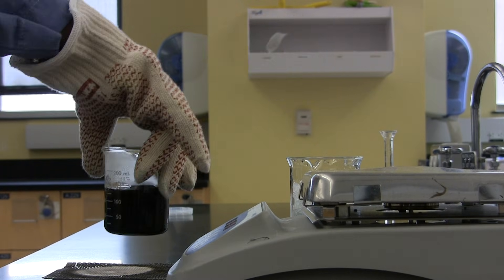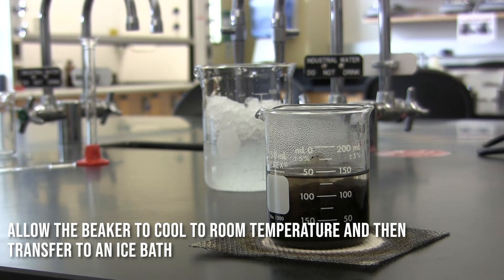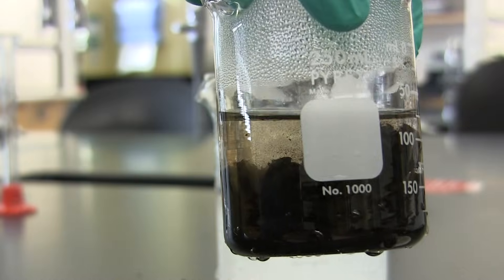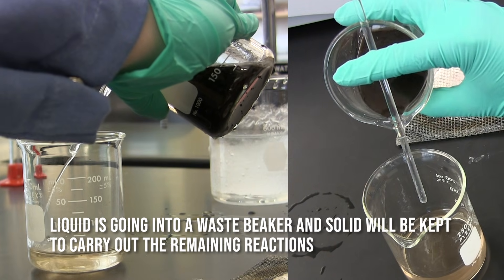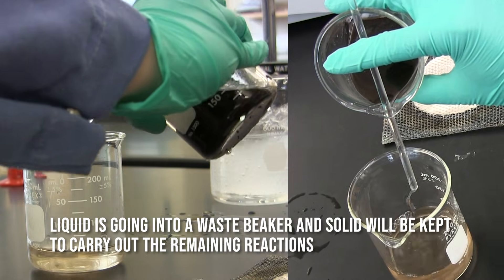Now we're going to remove the beaker from heat, place it on some wire gauze, and let it come to room temperature. Then we're going to put it into an ice bath and let everything settle out. The solution on the top is pretty much clear, so we're going to go ahead and decant that — removing the liquid portion.